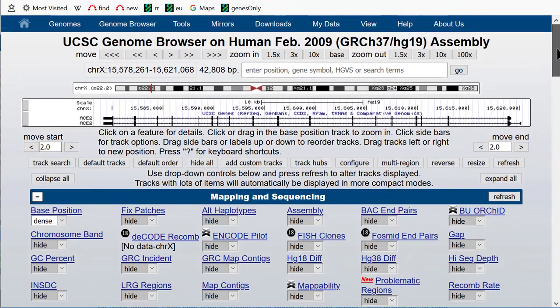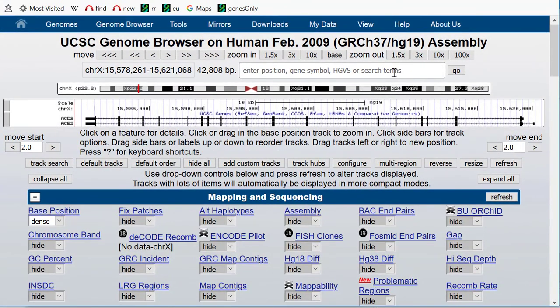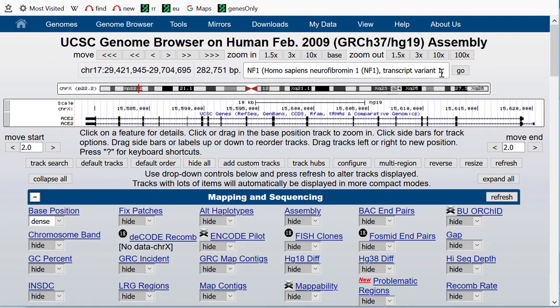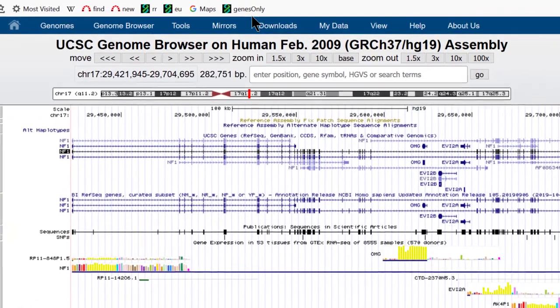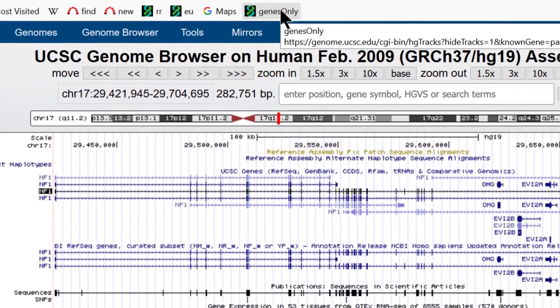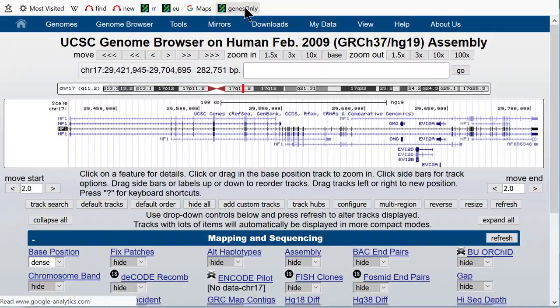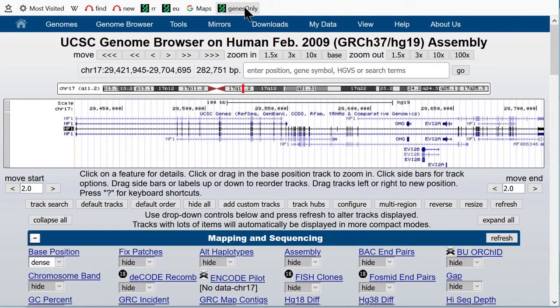This particular bare-bones link can be very useful if you make it a link on your browser toolbar. A toolbar link labeled 'genes only' will turn off all tracks except the track specified by the table knownGene. Leaving out the database designation will make the link work for any assembly you happen to be viewing if it has the table knownGene. For hg38 this will turn on GenCode genes at your current location; for hg19 it will be UCSC genes. It will also work in mouse. Watch as we move to the gene NF1, turn on all the default tracks using the button below the browser graphic, then use the link — gene track only. There is nothing to stop you from adding your favorite tracks to such a link, so those tracks will come on as well when you click the link.